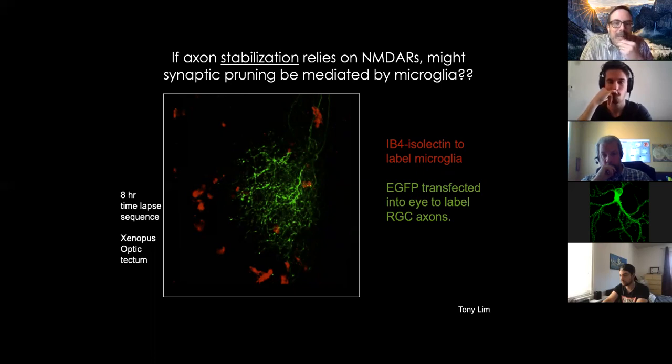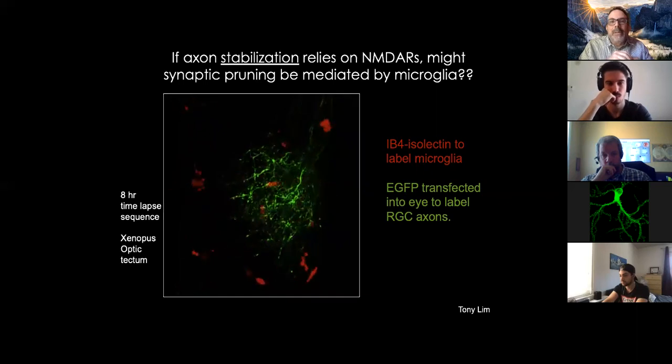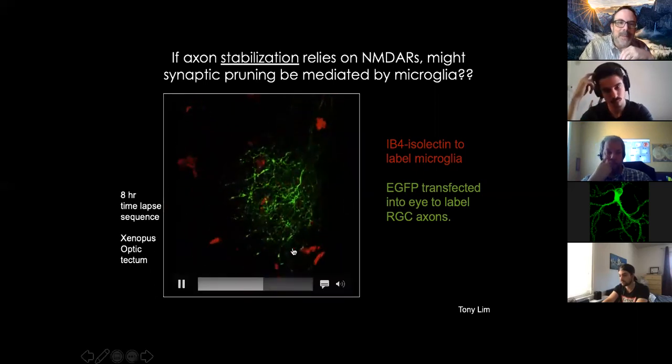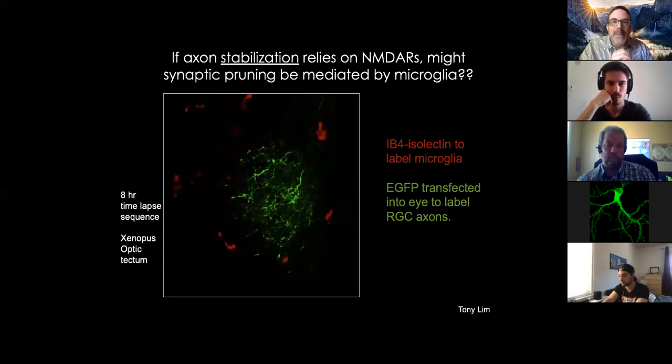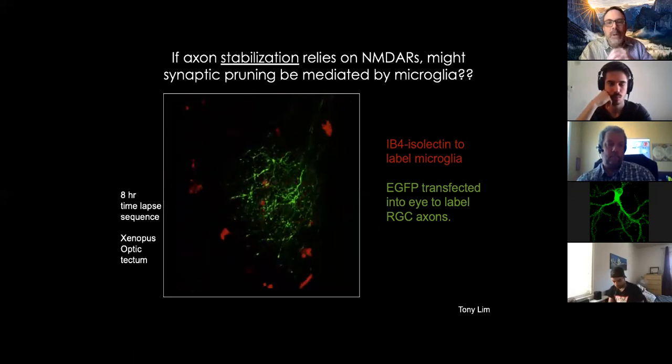So this is an example of an 8 hour time-lapse sequence of bulk labeled retinal ganglion cell axons, and you can kind of see them extending and retracting over time. Although again, because it's bulk label, it's hard to make out individual things. And then in red, it's the microglia labeled with that IB4 lectin, right? So you can see that the microglia are not just wandering around outside of the neuropil, but every once in a while, they'll dive in and wander into the neuropil, right? So there's opportunities for interaction.